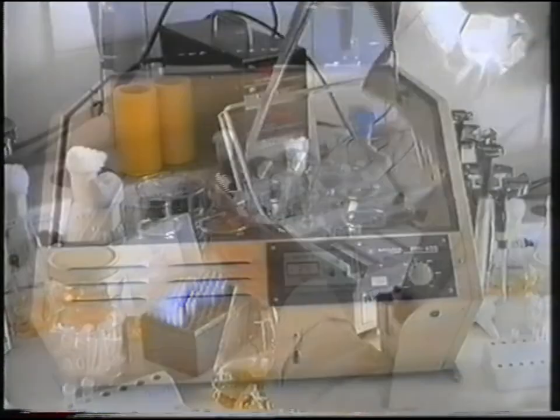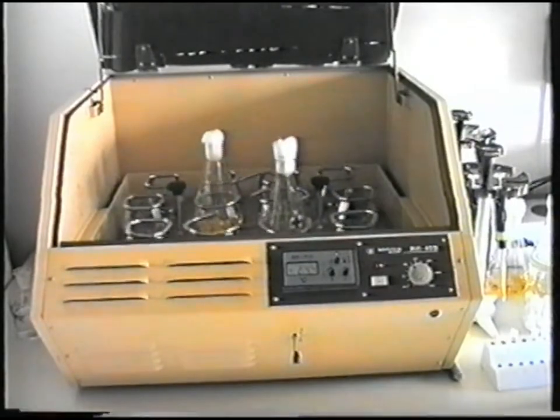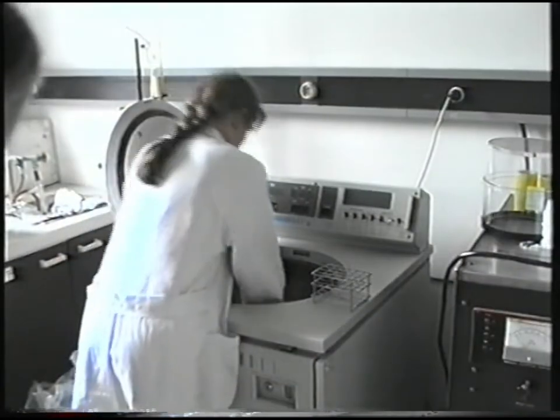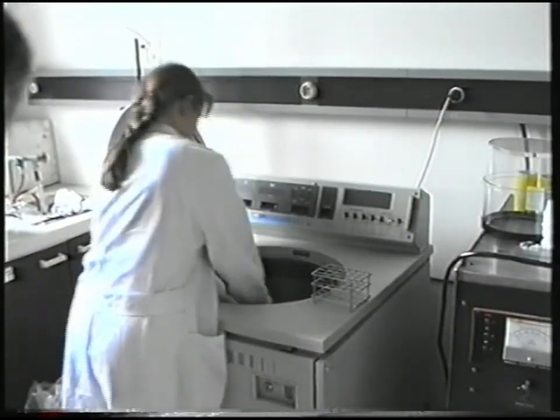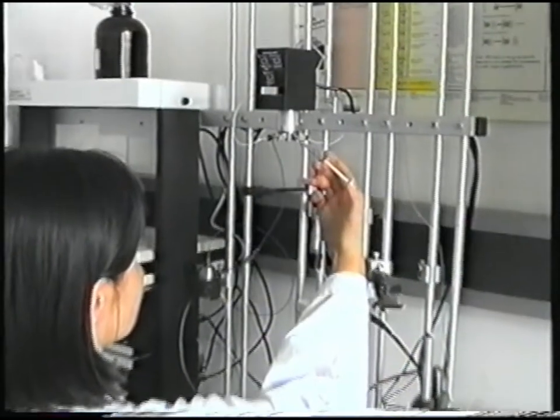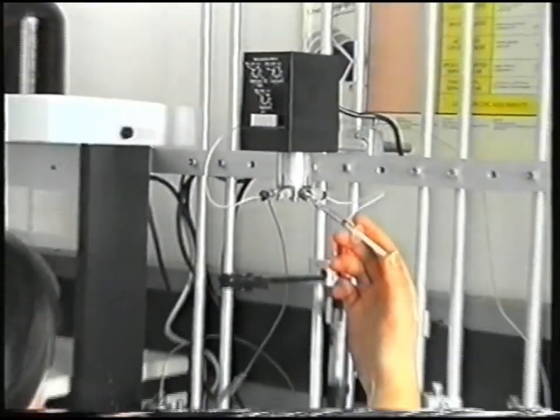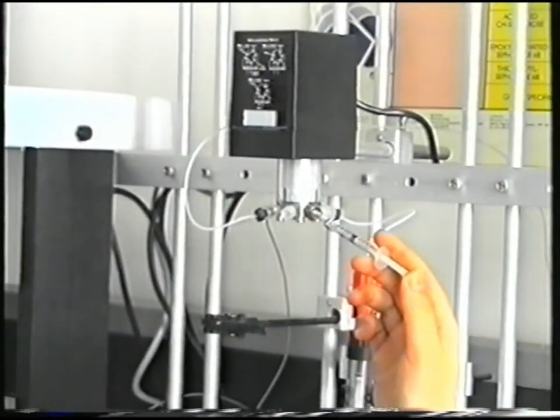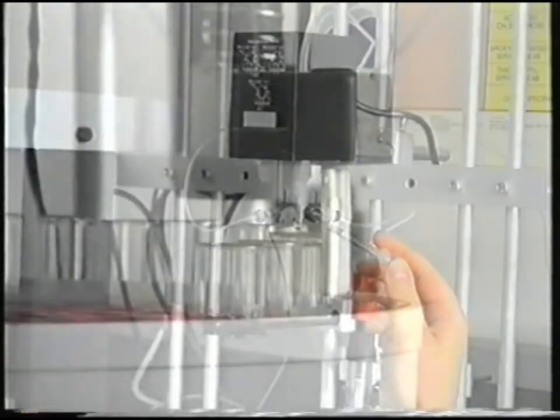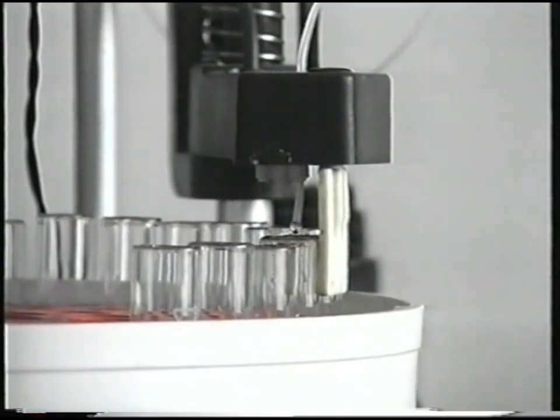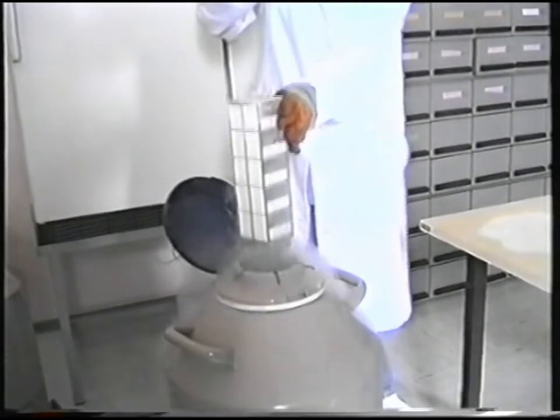A task for researchers is to define the optimal conditions for fermentation, that is, chemical composition of the substrate, as well as the physical parameters in a fermenter. For a better understanding of the mechanisms of product formation, the physiology and metabolism of a number of species are studied, while mutation or recombinant DNA techniques are used for the improvement of strains.